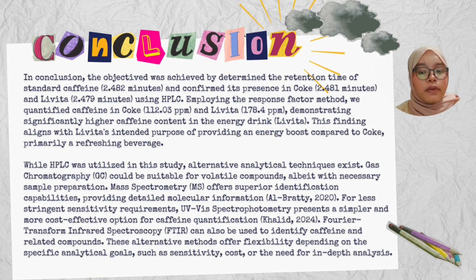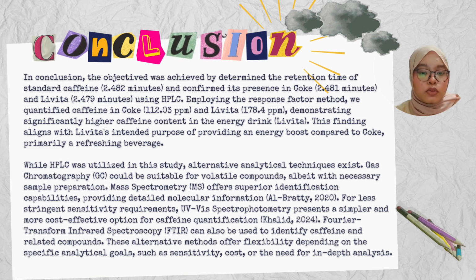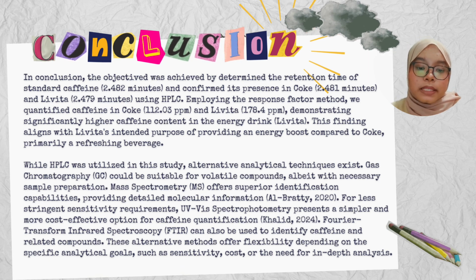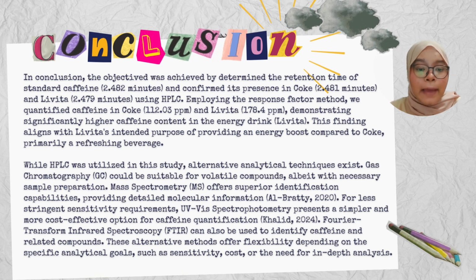Fourier transform infrared spectroscopy can also be used to identify caffeine and related compounds. These alternative methods offer flexibility depending on the specific analytical goals, such as sensitivity, cost, or the need for in-depth analysis.